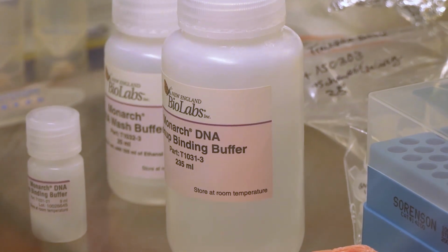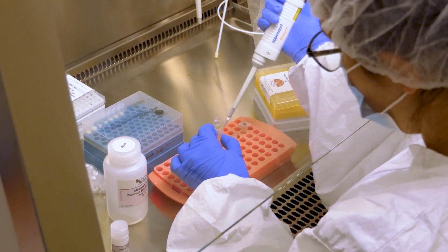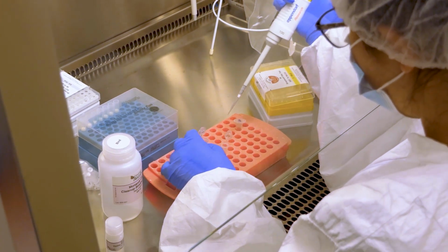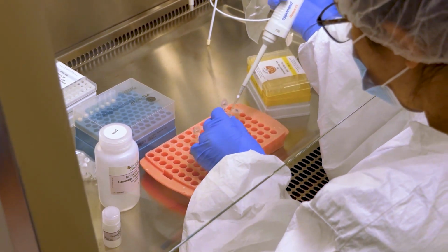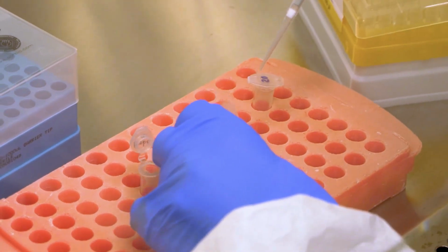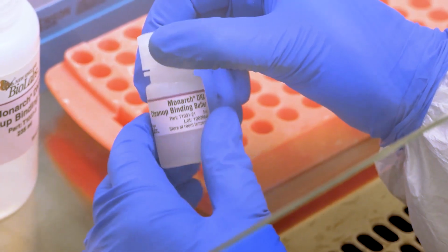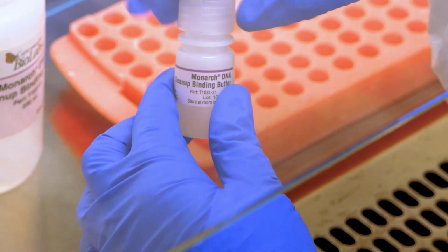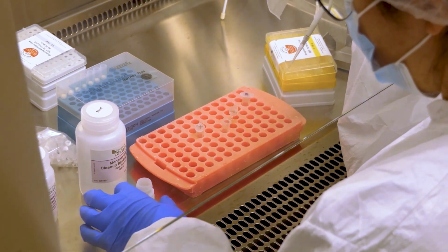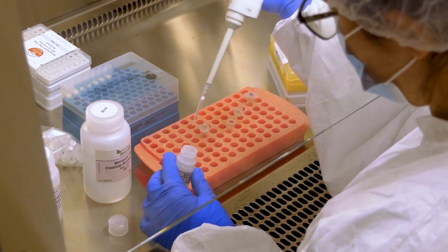The Monarch PCR and DNA cleanup kit comes with a specific protocol for oligo cleanup. Use this protocol for the DNA extraction to keep small fragments from being washed out during the next steps. Be careful to use the appropriate volumes of binding buffer and ethanol in comparison to your sample volume, since the protocol uses an initial amount of 50 microliters lysis product from your sample. Then you have to adjust the other volumes accordingly if you are working in a higher volume.